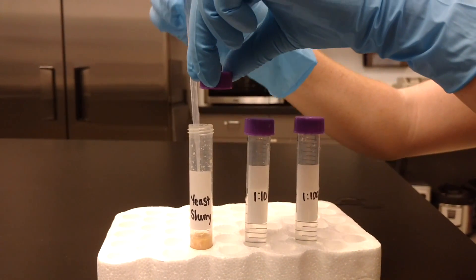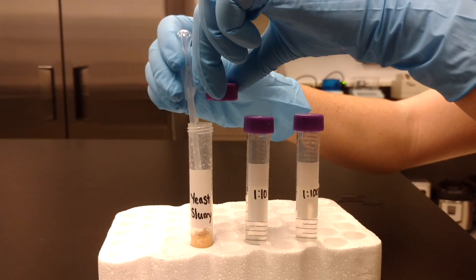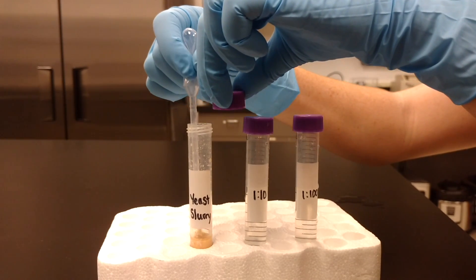Shake up the yeast, carefully remove the lid, and pipette 1 mL of yeast and place into the 9 mL water tube using a sterile transfer pipette.